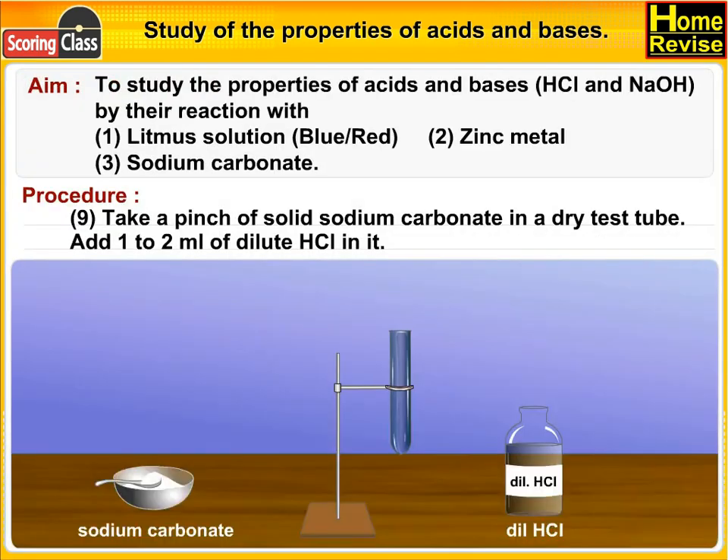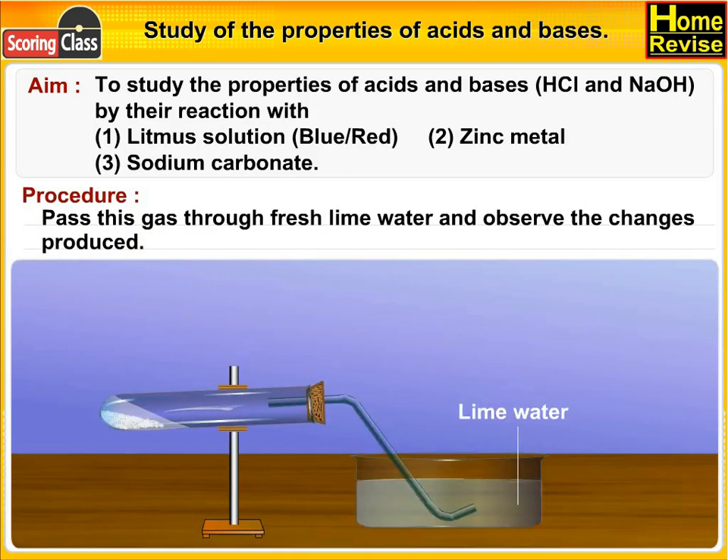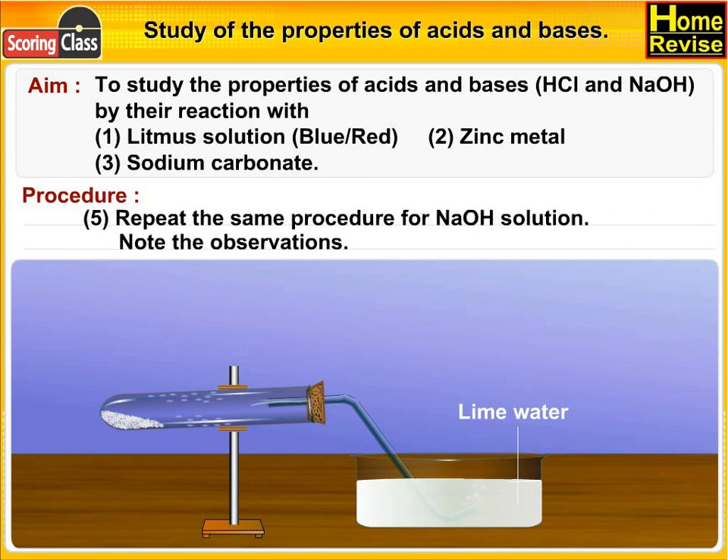Now take a pinch of solid sodium carbonate in a dry test tube and add 1 or 2 ml of dilute HCl. A vigorous reaction starts. Note the color of the gas evolved. Pass this gas through fresh lime water and observe the changes produced. Now repeat the same procedure for NaOH solution.